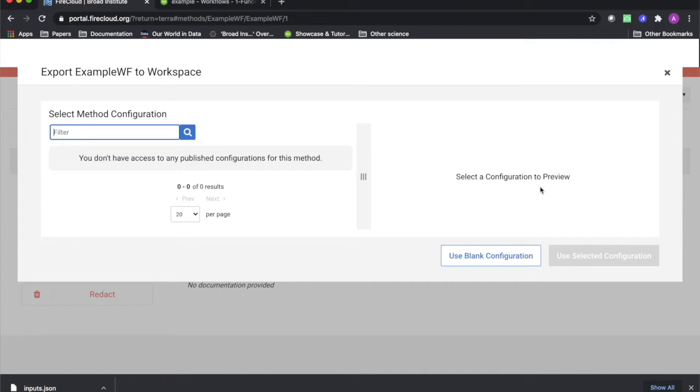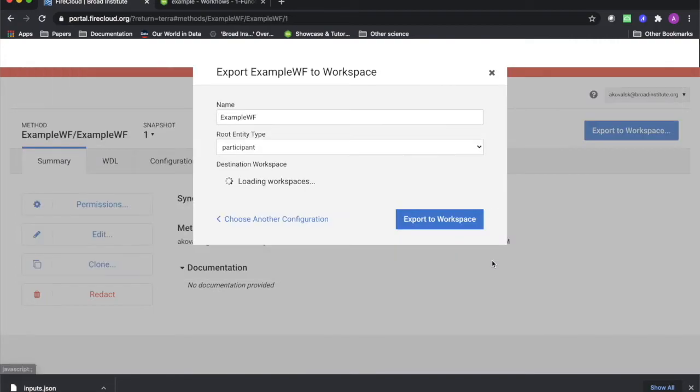Right now, we will select the option to use a blank configuration, and in the next screens we will see which fields this leaves blank.